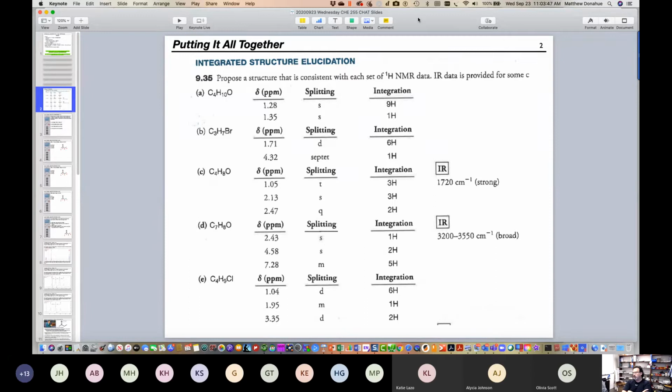So Hannah says 2 groups of hydrogen. Yeah, so that's essentially what I've been asking you guys. When you visually look at a structure and you determine unique sets of hydrogen, this is a different way of viewing that. So you count, there's 1, 2. They're only giving you 2 unique sets. So for example, down in part C, because there's 3 pieces of data, that's 3 unique sets. So you have 2 unique sets here. The ratio between them is 9:1.